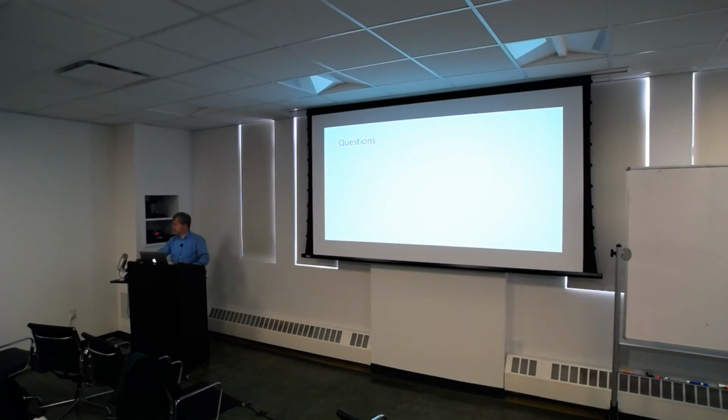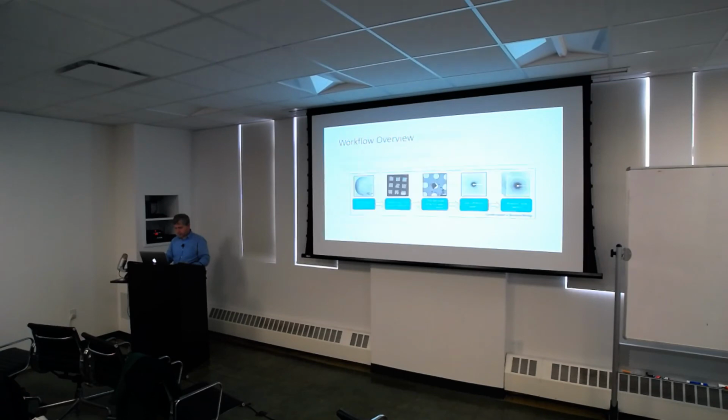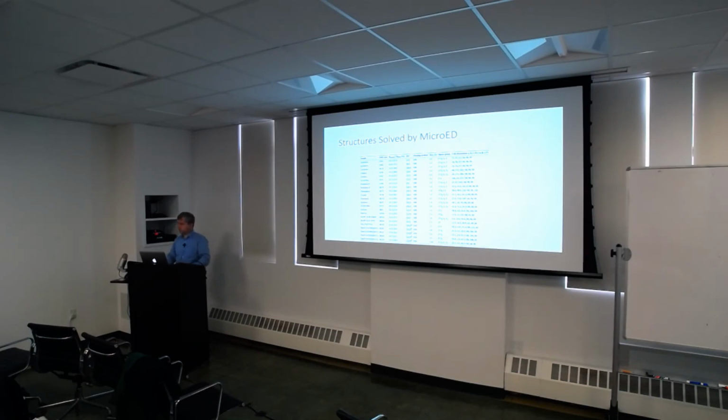Yeah, I think the only membrane protein, I'd look at that list again, but I think it's just a calcium pump, and I don't think that was cubic phase. It's just the calcium pump, and that would form these very thin 3D crystals that were only a few layers thick, and then they managed to get some tricks to make it a little thicker. That's pretty encouraging. They can solve P1, right? Yeah. Even with the missing wedge and all. That's great.